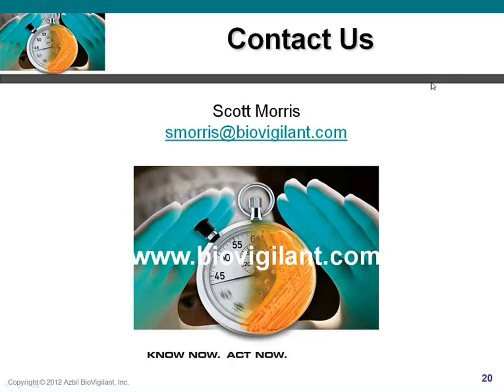Of course, because the IMDA system is generating data continuously and you're able to see that instantaneous feedback, one could always put a probe in an environment and then proceed to move it around over the space of minutes, hours, or days and let the data help decide where they want to place the probe. So that is a feature that is much easier to implement with something like the IMDA system as opposed to a traditional method.